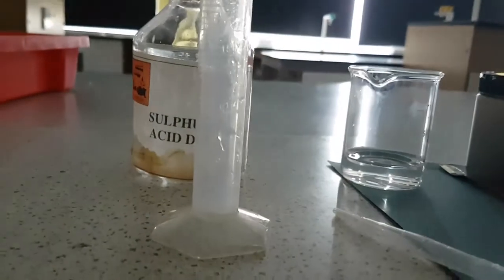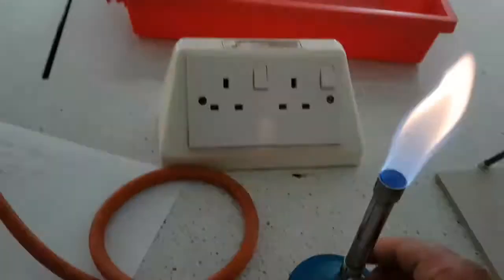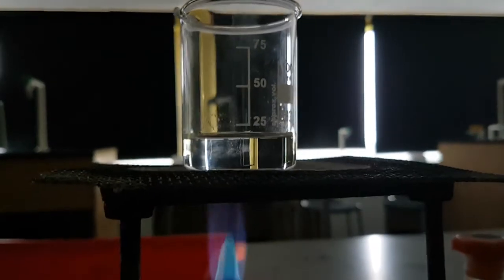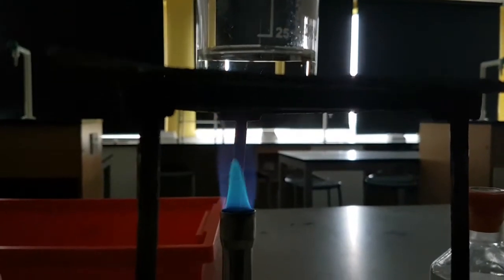Next we're going to heat the 100 ml beaker — we're going to warm it. Remember, we do not want to boil it, we just want to warm it up. I'm going to put my Bunsen burner on a roaring flame — the hole needs to be open. I'm going to place it underneath and just let it warm up so that the rate of reaction between the sulfuric acid and the copper 2 oxide will happen quicker.